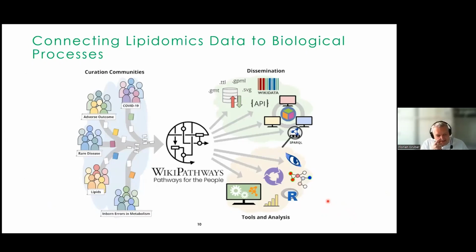Of course, these data sets for the lipid molecular species can then be used for quantitative analysis and systems biology. And lipidomics is usually considered to be a subset of metabolomics.